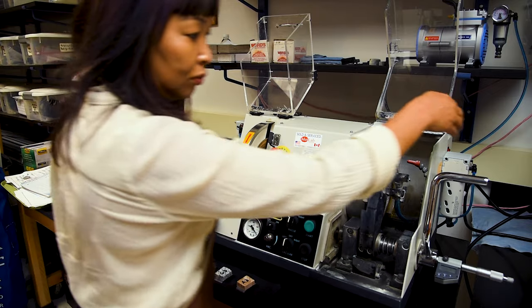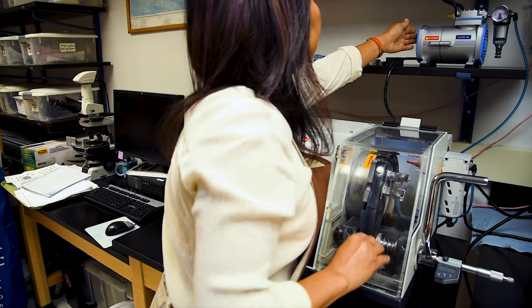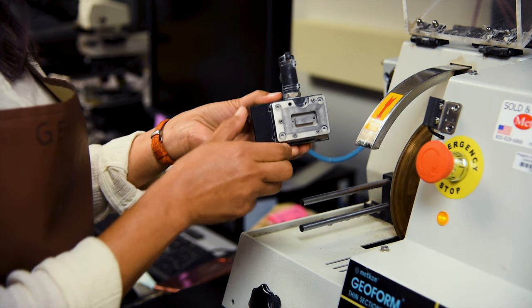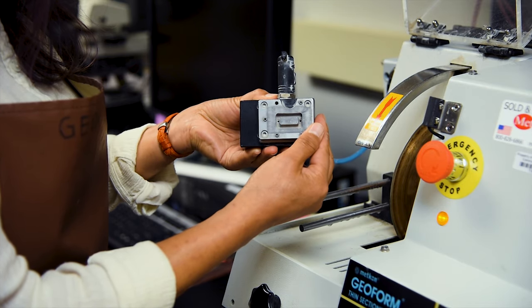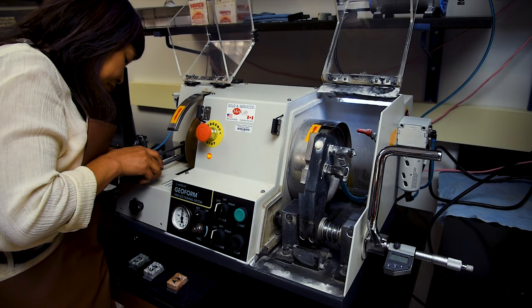Now that the sample chips and glass slides we epoxied have had a chance to cure overnight, they are ready to be taken to the cutoff saw, where we will remove most of the chip from the slide, leaving only a thin layer approximately two millimeters thick. Once the equipment has been powered on, the vacuum chuck should be inspected to make sure it is clean and free from debris, otherwise the mounted slide may not stay firmly affixed to the vacuum chuck during cutting.